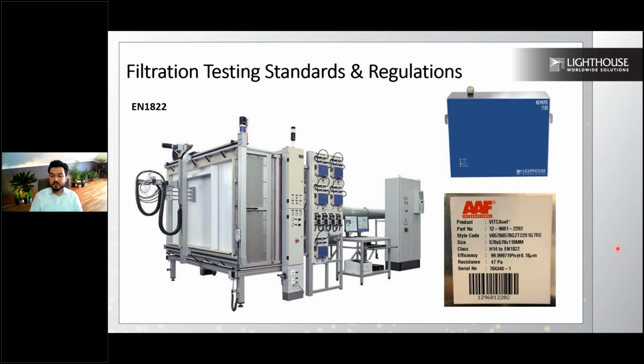Each filter comes with these stickers on it, showing you the size and class of your HEPA filter. In this case, according to EN 1822, this filter is classified as H14 with an MPPS described as 0.18 micron, and the efficiency number, which is the weakest point of this filter, is 99.999719%.